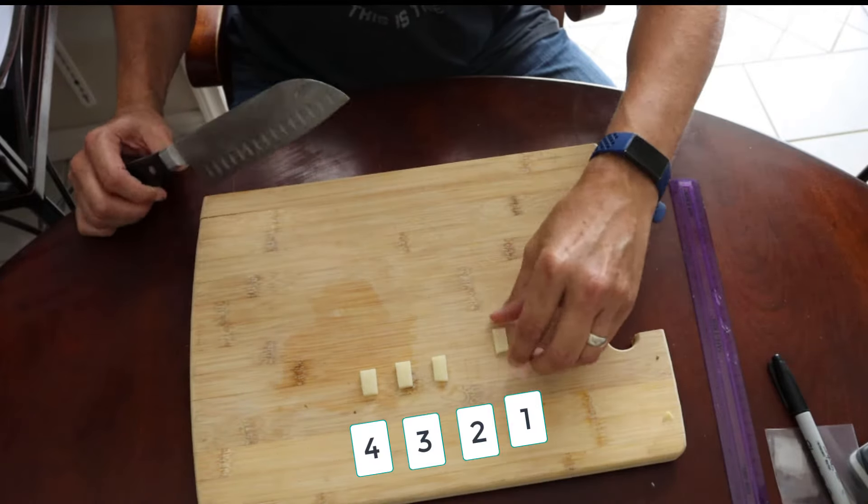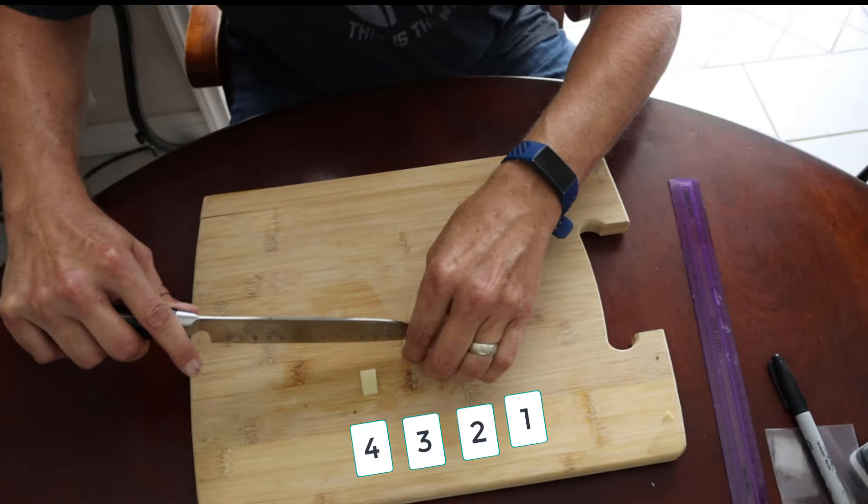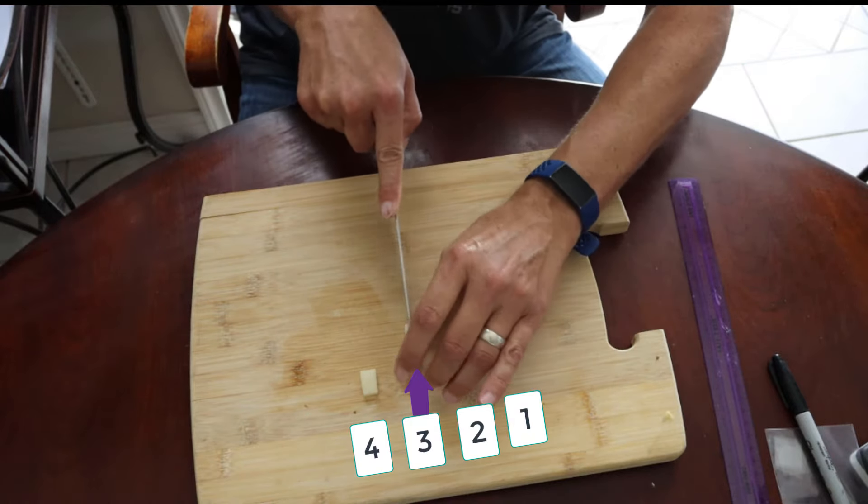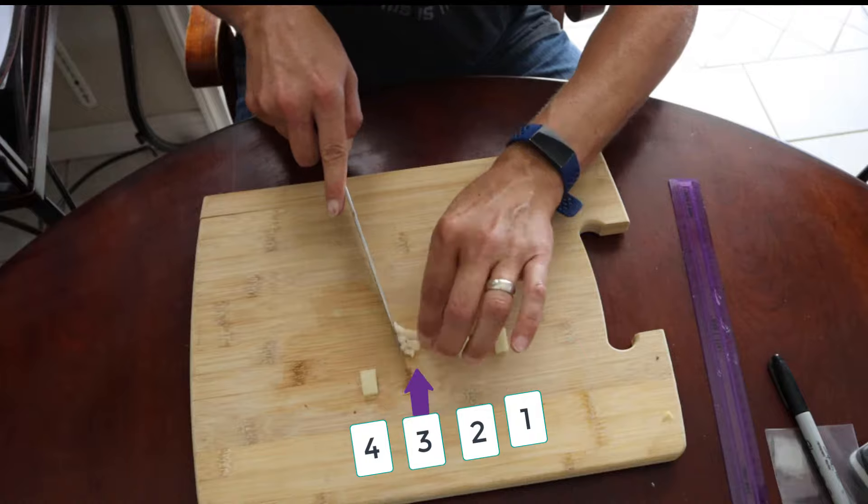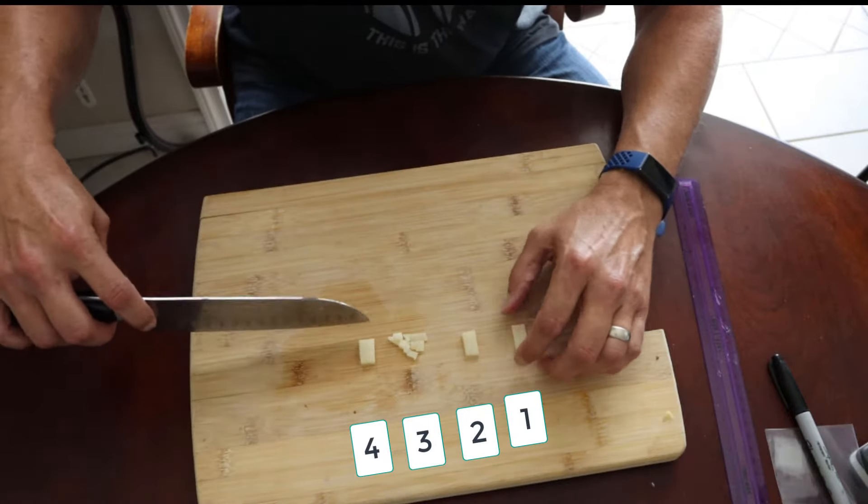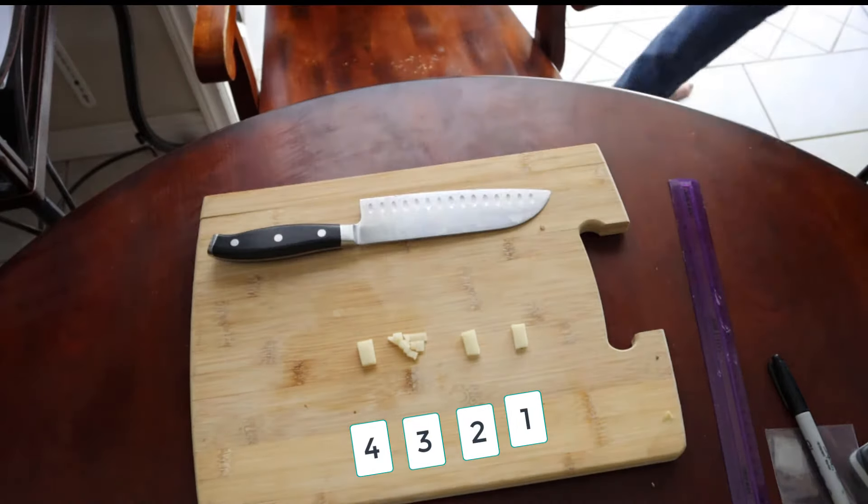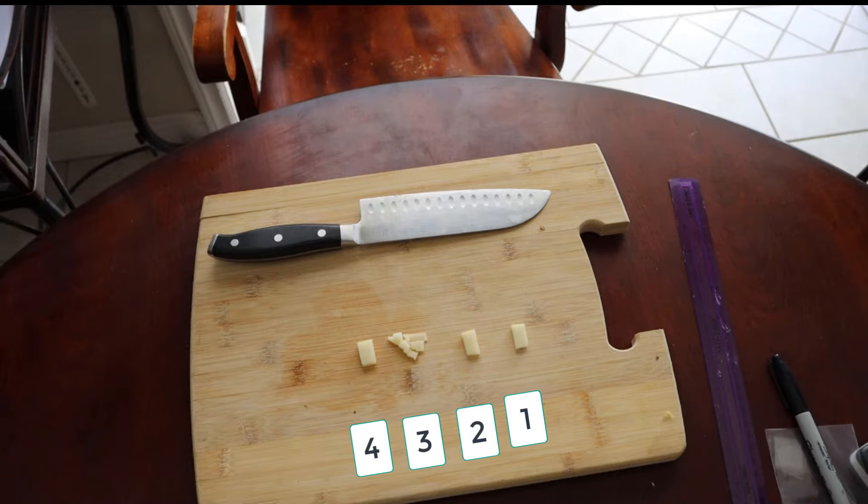Potato three we're going to cut up into small tiny chunks as you see there. The goal of what we're doing is we are creating the same amount of potato as the others, but this one will have a much higher surface area because of cutting up the potato.